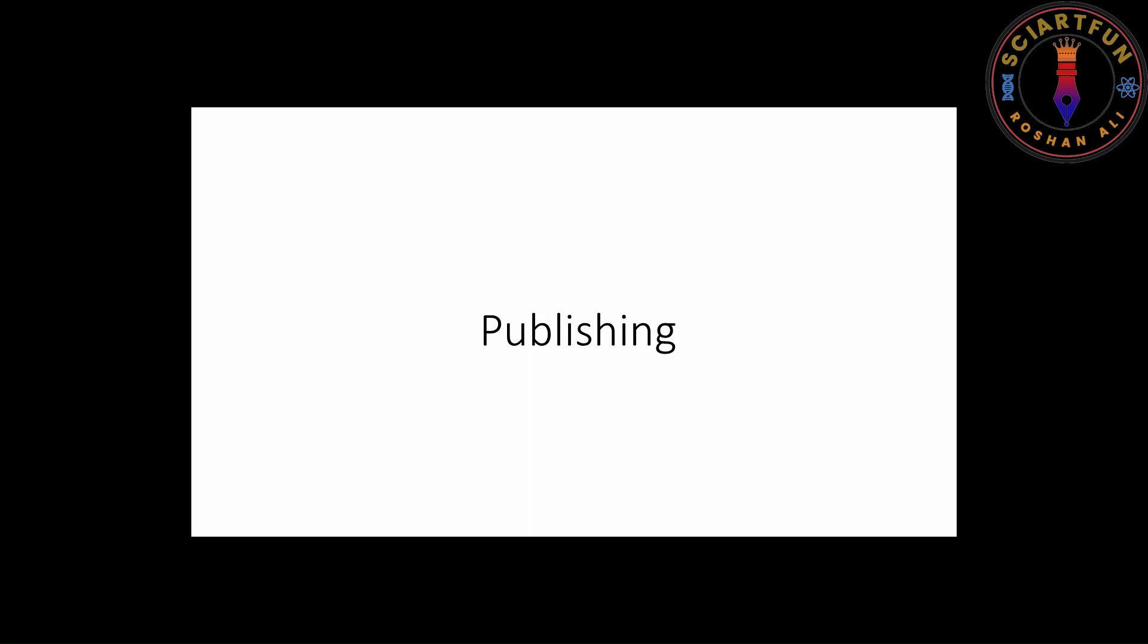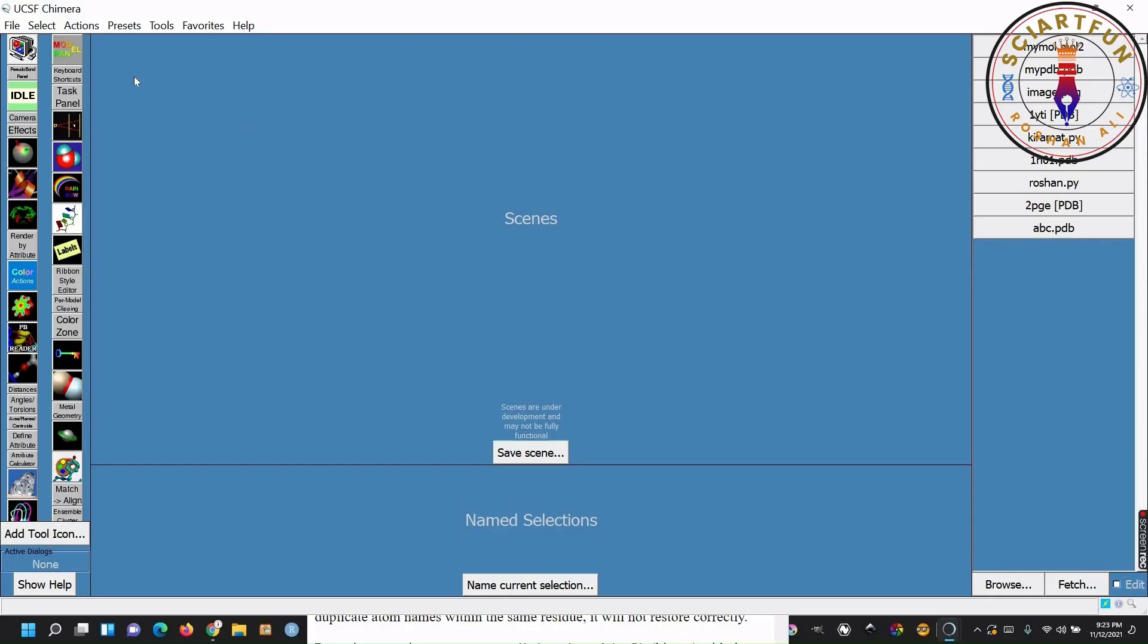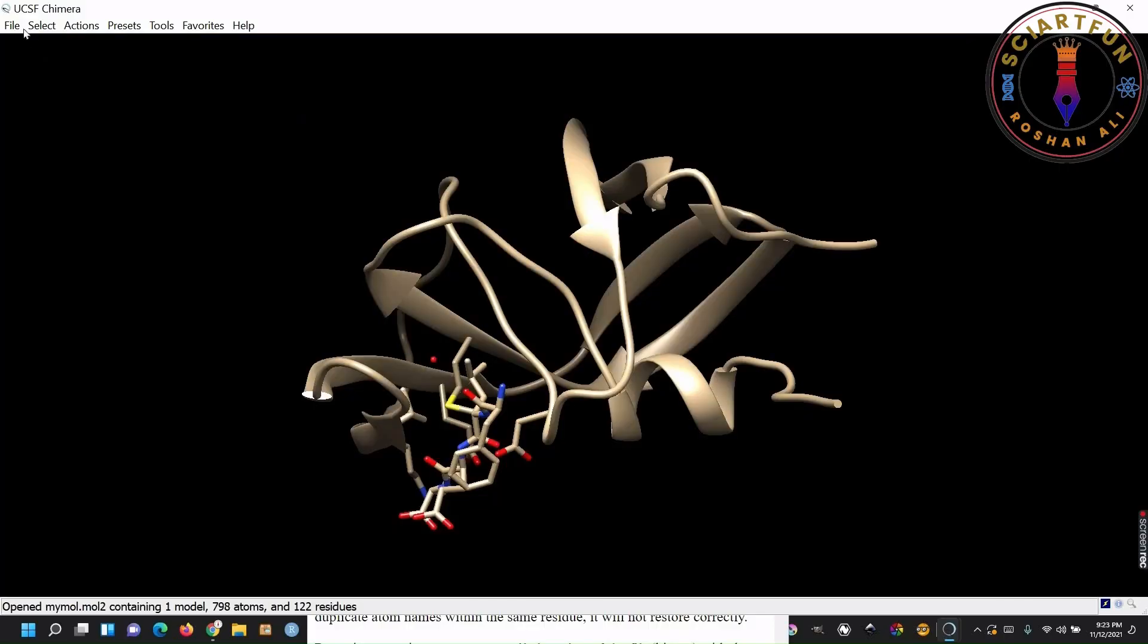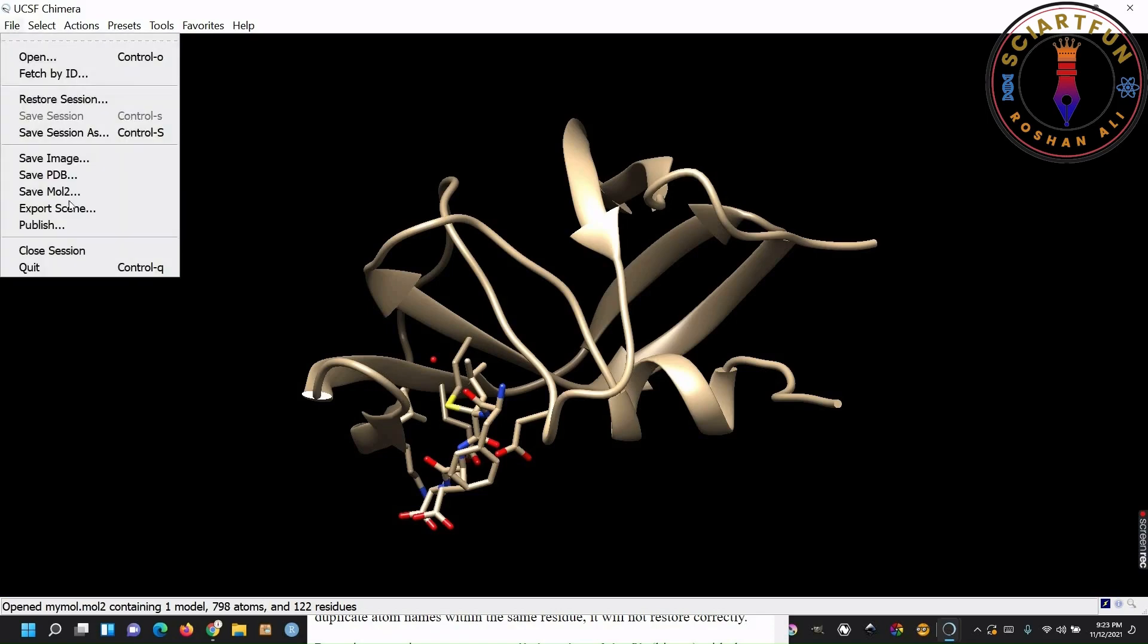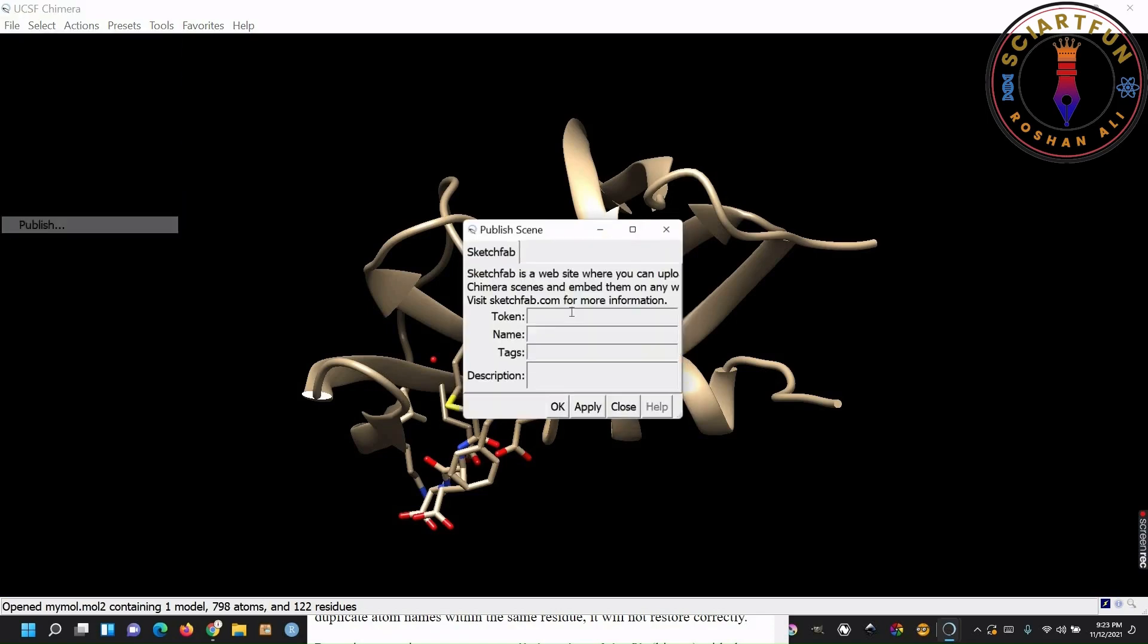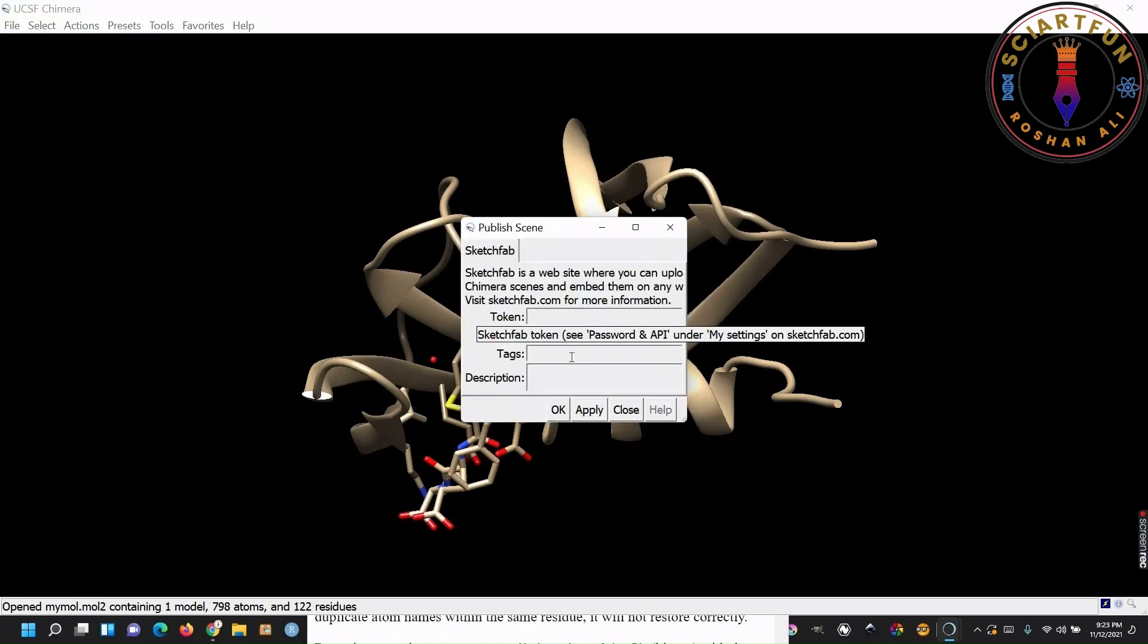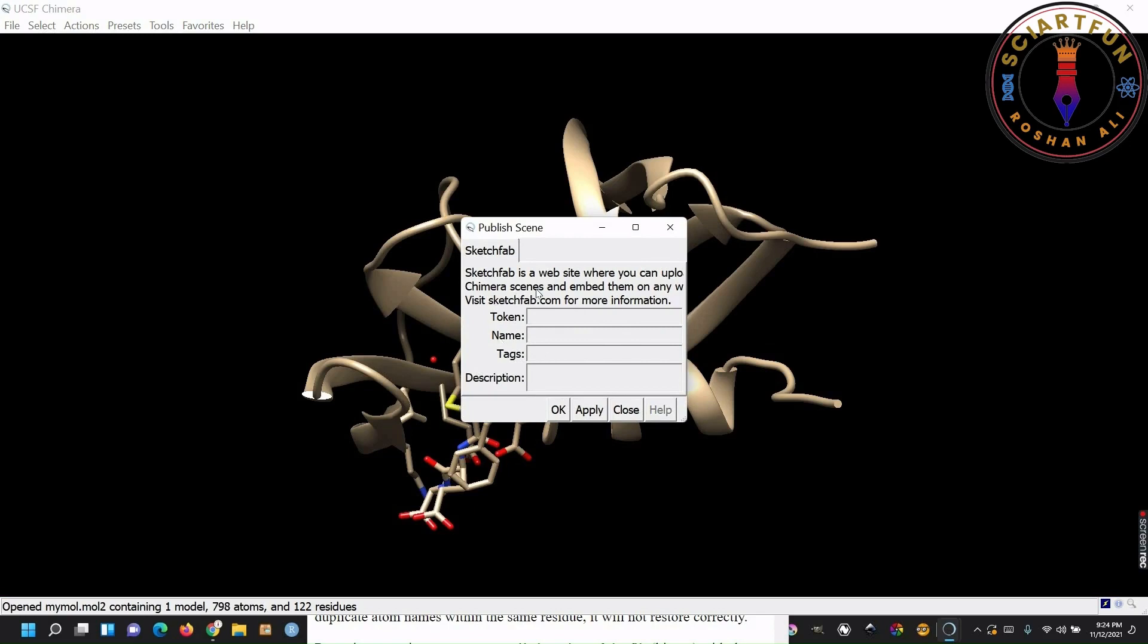You can also publish your structure to the sketchfab.com database of 3D models. To publish your model to the database just go to file, click publish, fill in the data in this form. Click apply and ok.